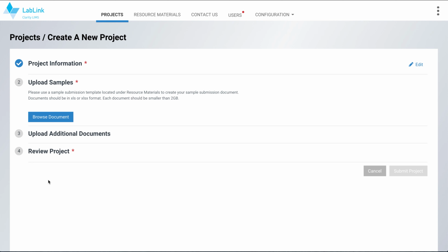I will now upload the file that I just filled out from the Resource Materials tab.